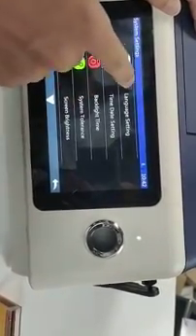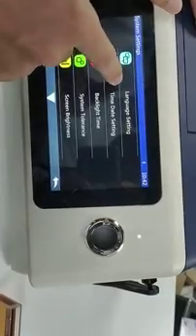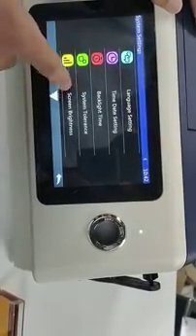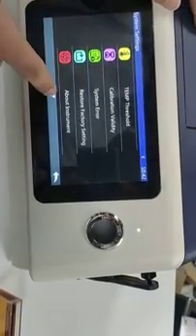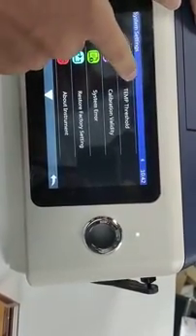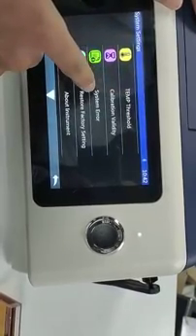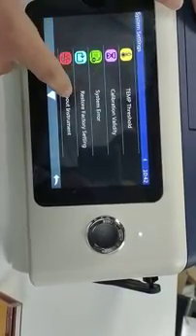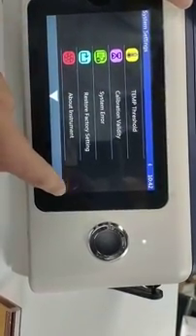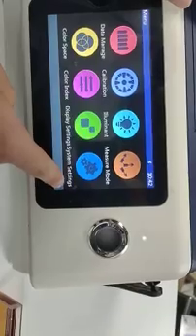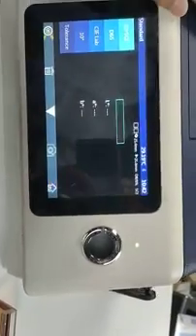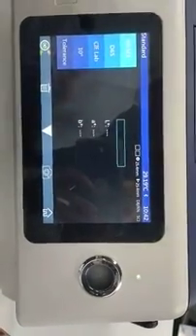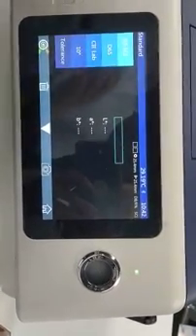Language settings. Time settings. System tolerance. Temperature. Ok. Ok, let's start to measure some samples.